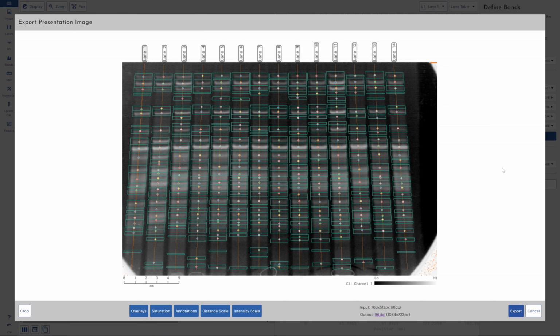So when we do this, we get access to a lot of different options that we can overlay on top of this information. So we've got things like our scale bar. So if someone's just seeing this image and they've never seen this image before, or even our software before, they can start interpreting what everything means just from an image alone. So we've got our areas of saturation here in orange, which again I explain in other videos. We can see our low and high measurements.